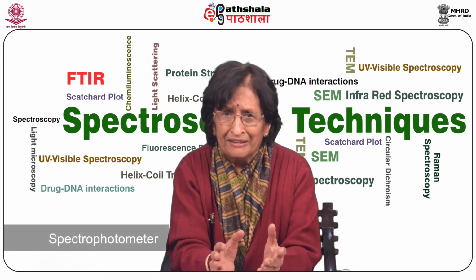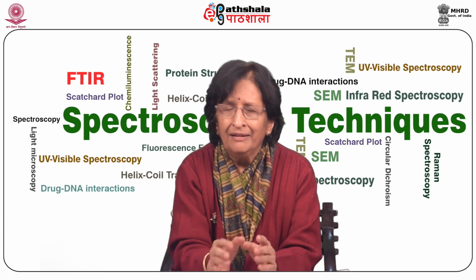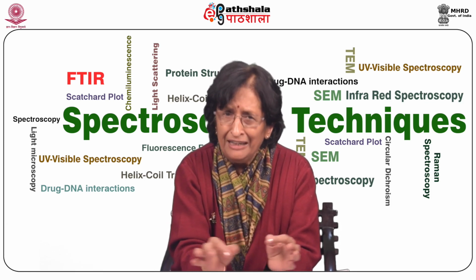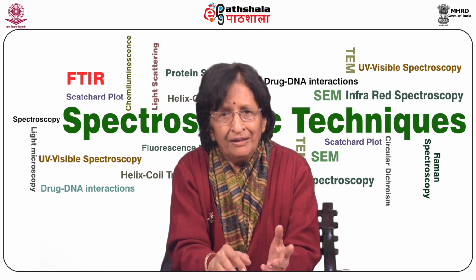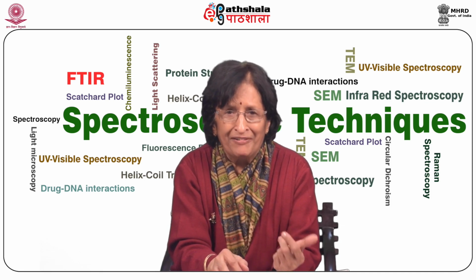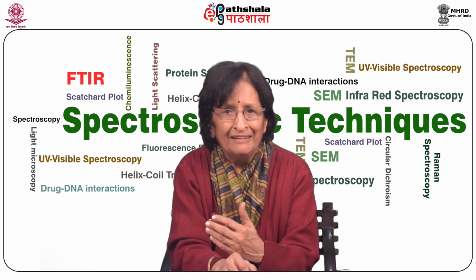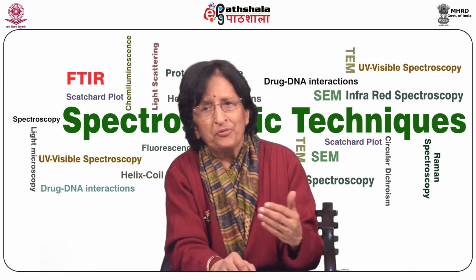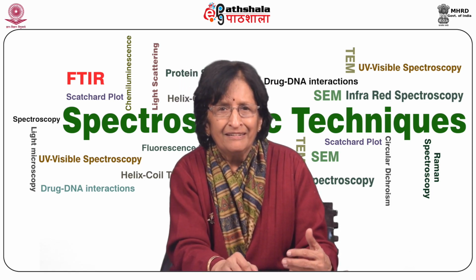So spectrophotometers are of two basic different classes. They can use a single beam or a double beam. In a single beam instrument, for example, Spectronic 20, all light passes through the sample cell and it has to be removed for measuring reference intensity.